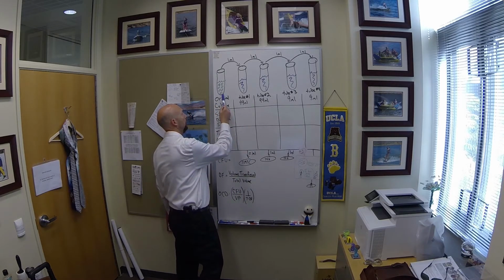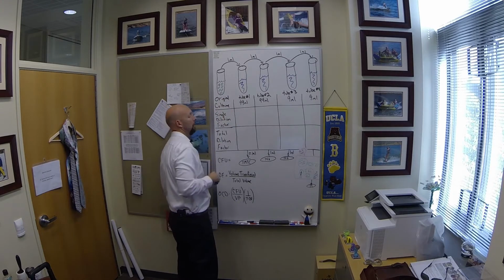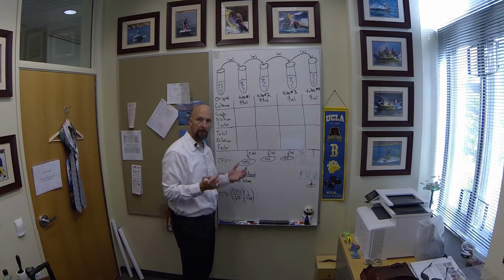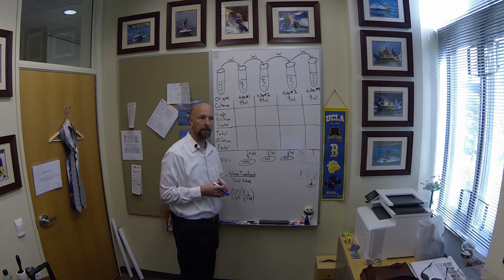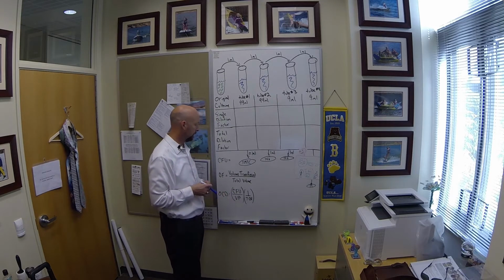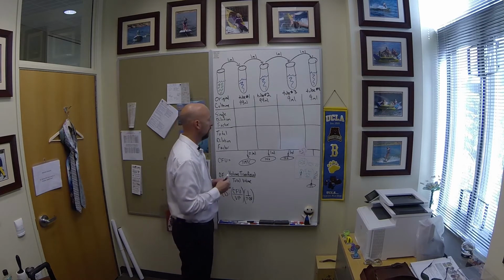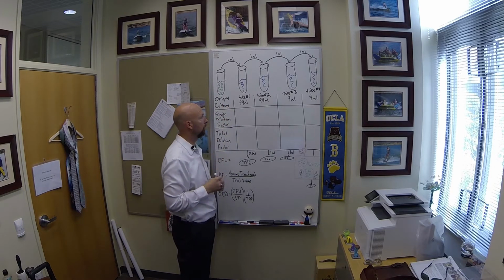We've got a culture, our original sample, that has a lot of bacterial cells in it, and we want to determine what the density or the concentration of those bacteria is in CFUs per mil. CFUs per mil is the concentration that we're looking for in this original culture.